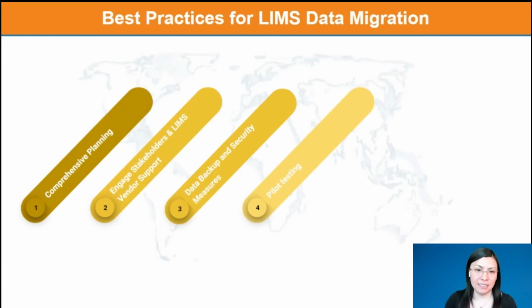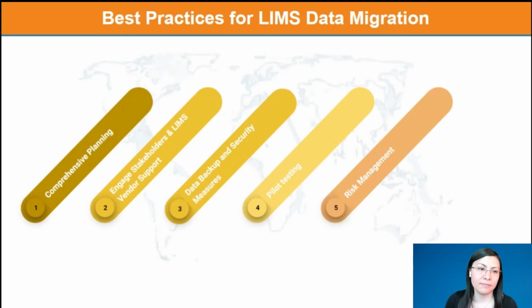The fourth is pilot testing. It's very important to start testing with a portion of all your lab data. Instead of having all your data loaded and just going live, you test a little bit of your data and make sure that all the features work properly, and then you can go with more confidence and load and work with all your data.